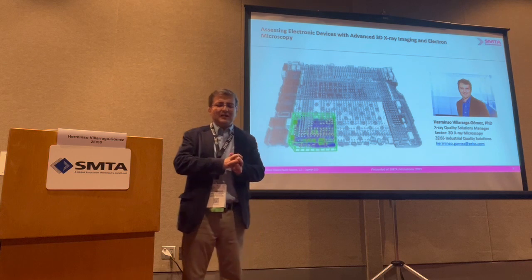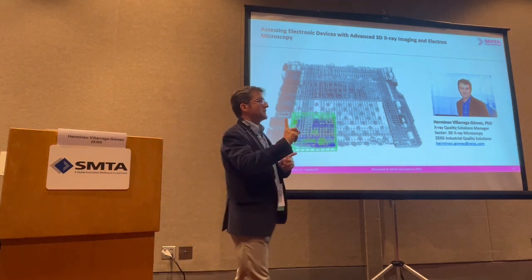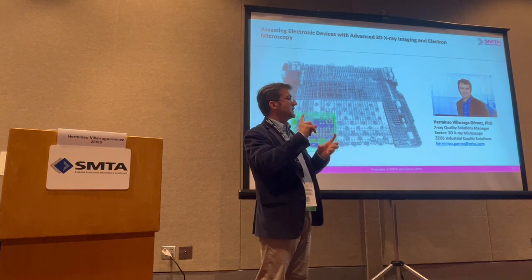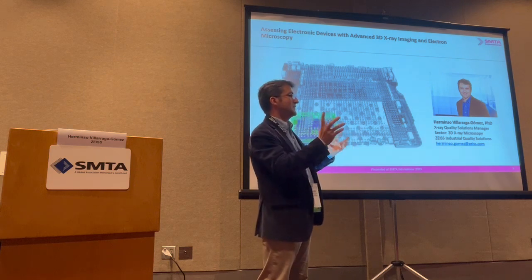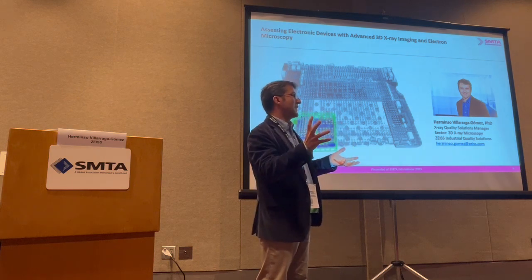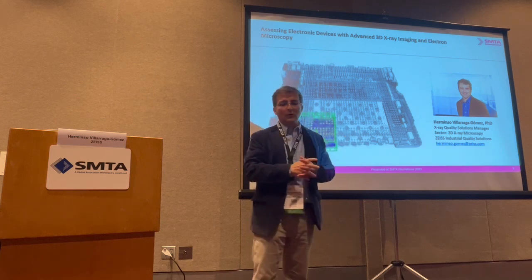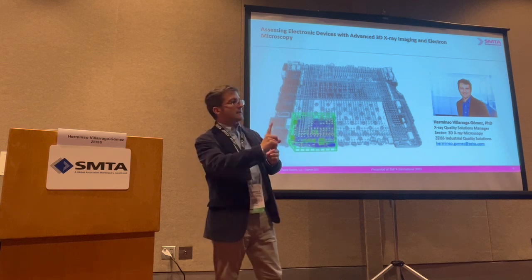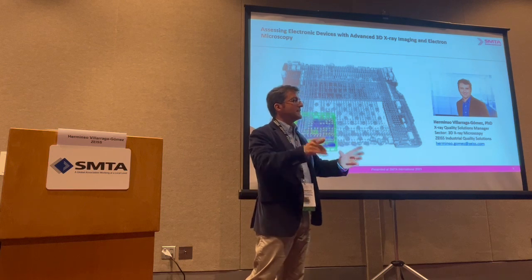That's possible, but you have one challenge, and it's the scan time. If the process is happening so fast that you cannot capture it, when you go through the 360 or 180 rotation, it already happened. So you missed out. The process has to be slow enough so you can capture several scans, 360 or 180, and capture that.